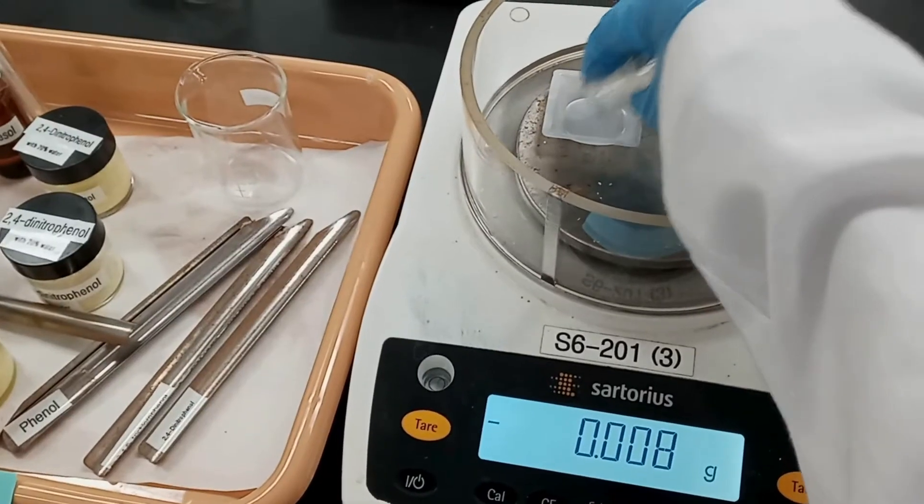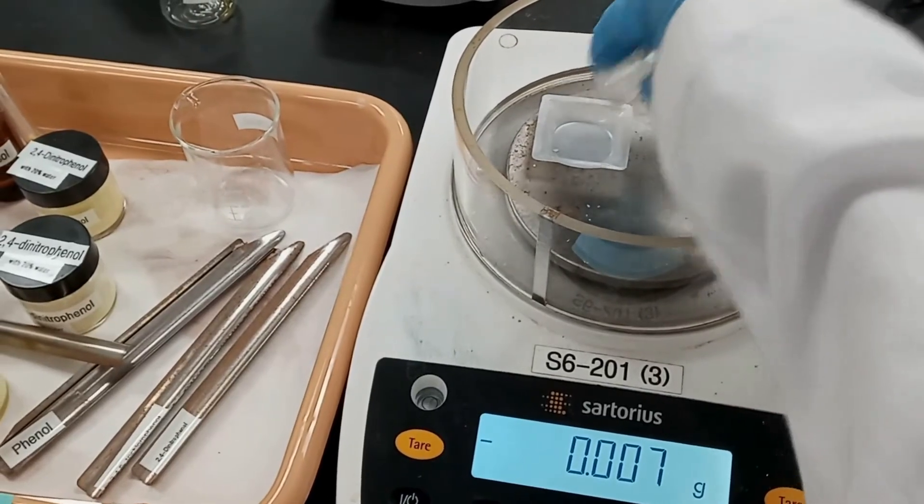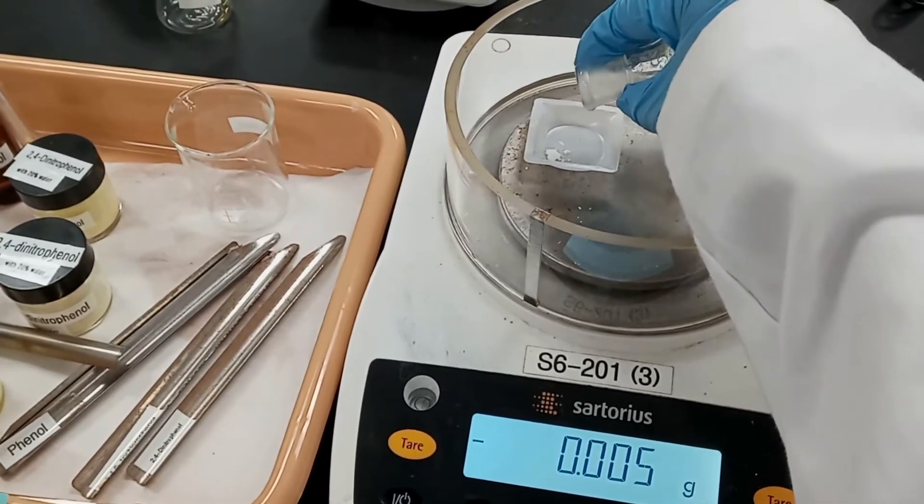We then painfully struggled to get as much of it out of the round-bottom flask as we would need it for the next part. We were only able to scrape out 0.32 grams.